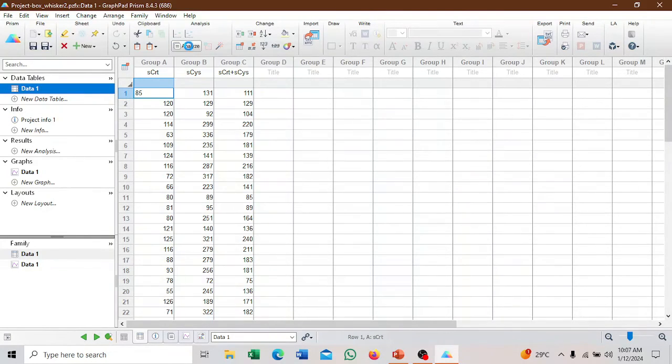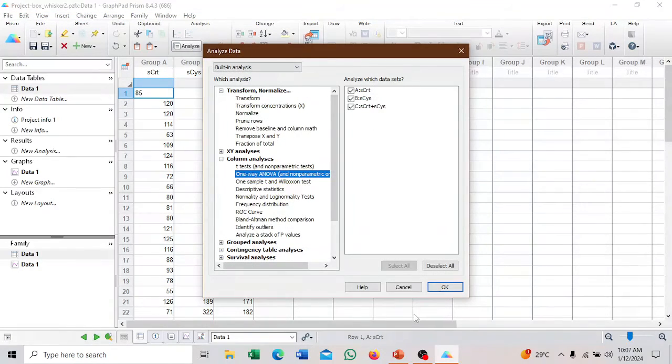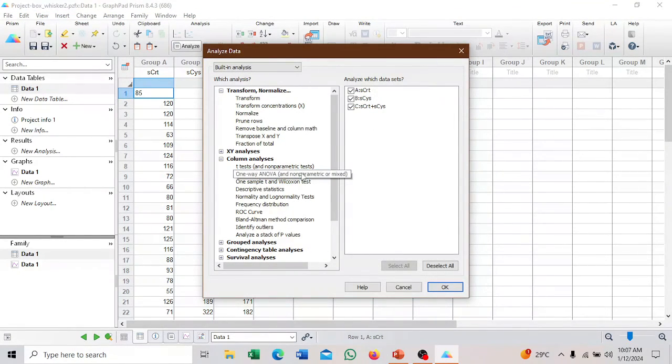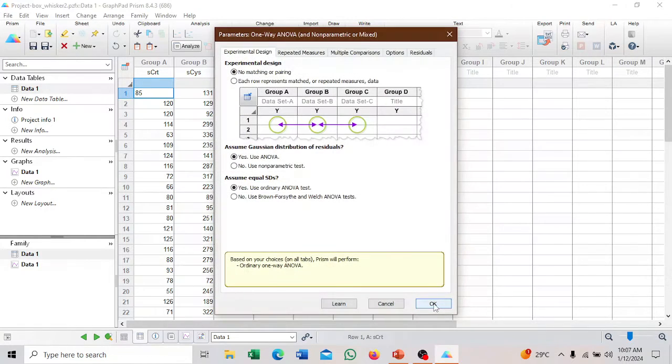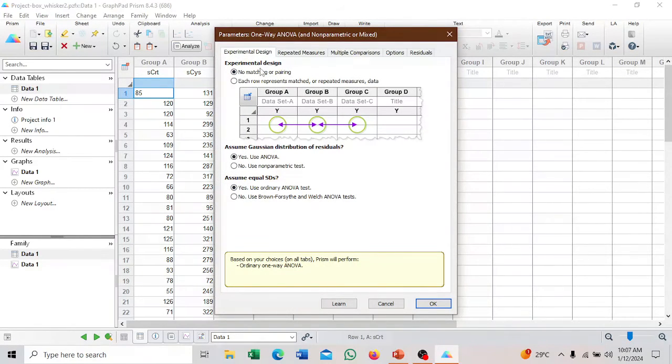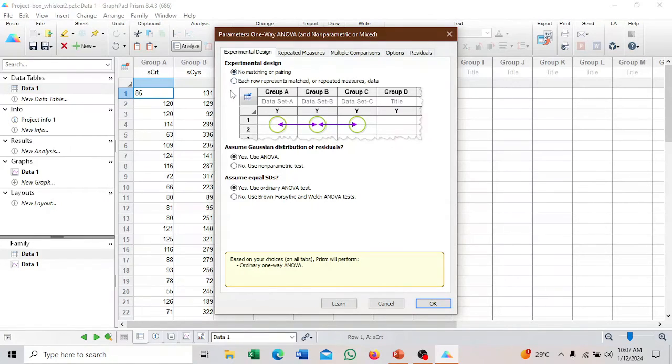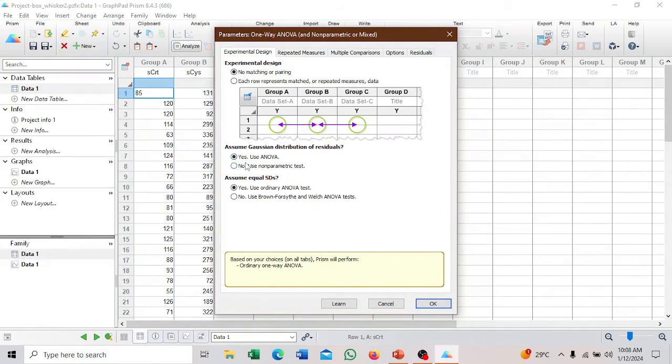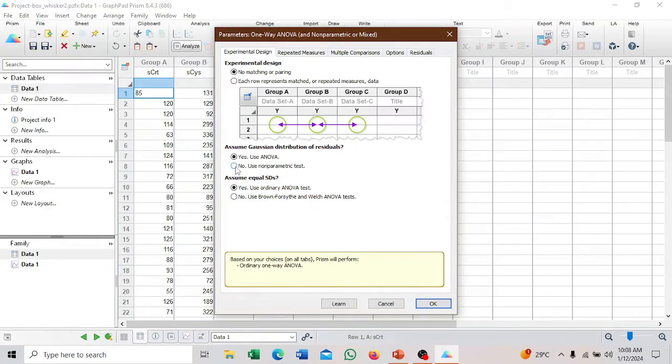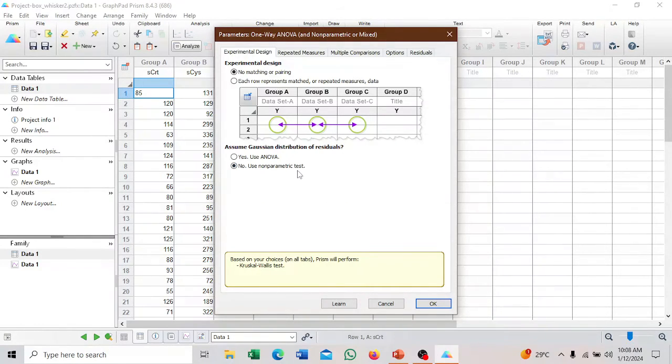We'll go to analyze. You see one-way ANOVA here, and then we have the non-parametric or mixed. That is what we want to do. Then we click OK. You see experimental design, no matching or pairing. It's just single data, we didn't do duplicate. But here, assume Gaussian distribution. This data is non-parametric, so we'll choose use non-parametric test.